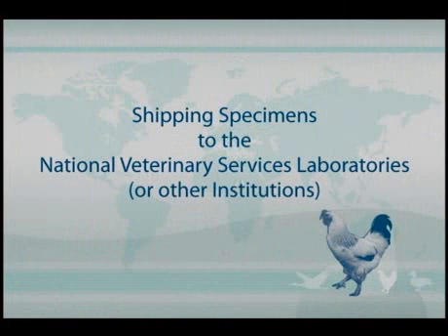Now a little bit about shipping samples, not only to the National Veterinary Services Lab, but this would apply to any laboratory pretty much in the world. And the intent of what I'm going to tell you should only be the basis for you to do further work in this area, because the regulations on shipping diagnostic samples or even known viruses has changed significantly in the last few years, and it's still evolving on a regular basis.